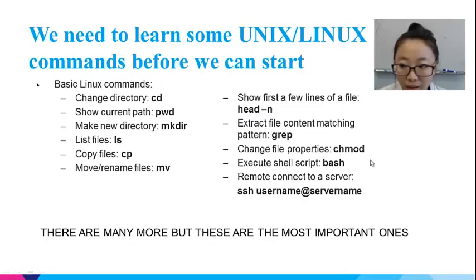Using the TopHat and cufflinks pipeline is challenging for biologists since it's designed to run on the UNIX/Linux system. Although most of the popular Linux distributions come with a graphic user interface, TopHat and cufflinks do not have such a utility, and everything will be invoked and set up from the command line. Therefore, we will first learn some basic Linux commands before we can start.